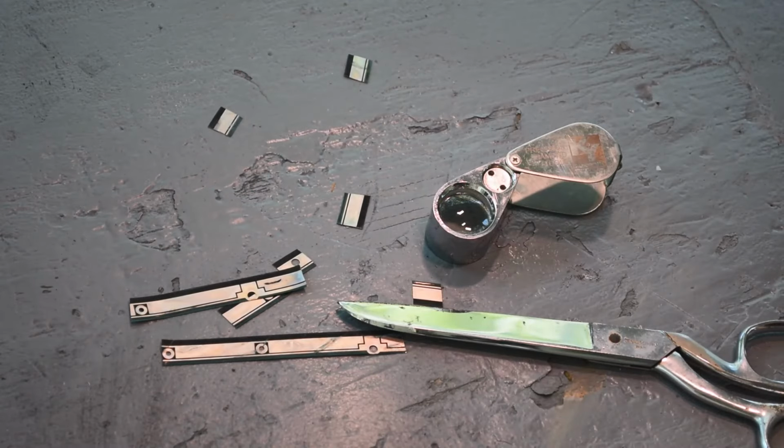So there's a lot more metal in there to remove than I thought there was. So I'm just going to let that cook in the dilute nitric acid for a little while longer. If there is palladium there, I know it's not going to go into solution until all of the more reactive metals are in solution. The nickel, the copper, anything else that's in there that's more reactive than the palladium. And the palladium is going to be way down on the list of reactivity, down with gold and platinum. So I'm just going to let it cook. And so the mystery is, what are those floating foils in there? Are they palladium or are they nickel? I don't know. I guess we're just going to let it cook and see what happens.